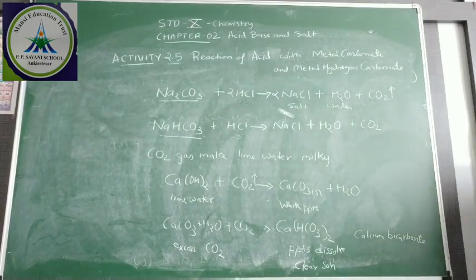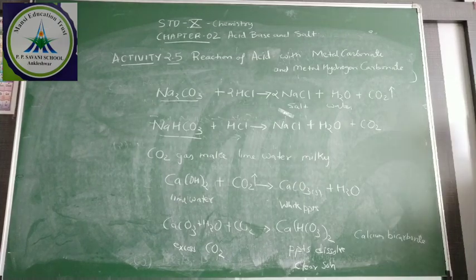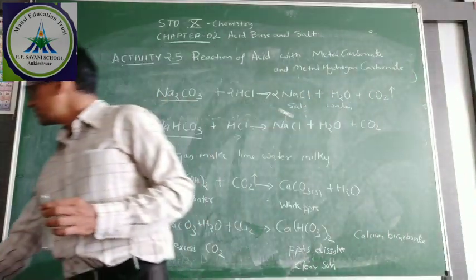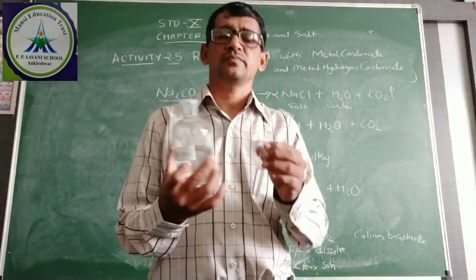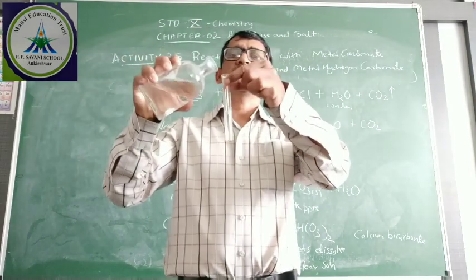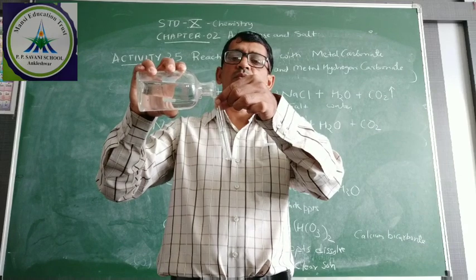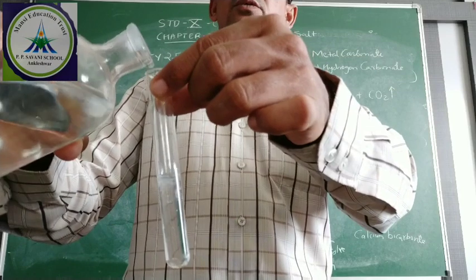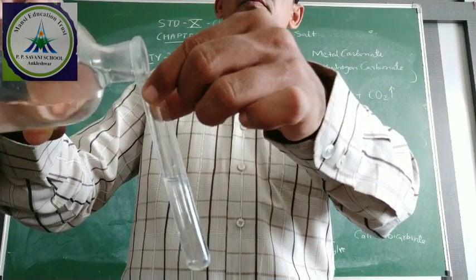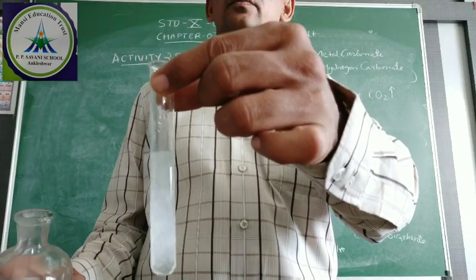In that I am adding acid. Slowly I am adding hydrochloric acid to it. You can see effervescence will take place. First I have added 1 or 2 drops. You can see when the acid is added, salt and carbon dioxide are produced.